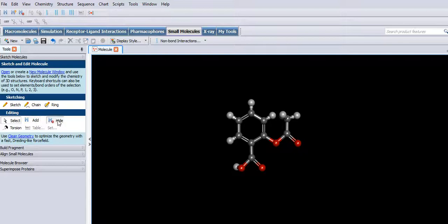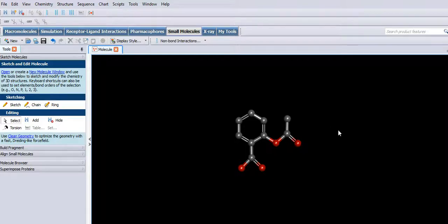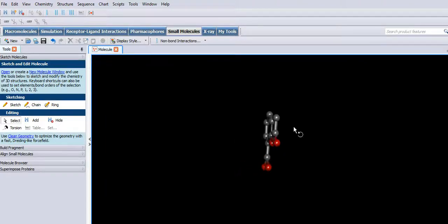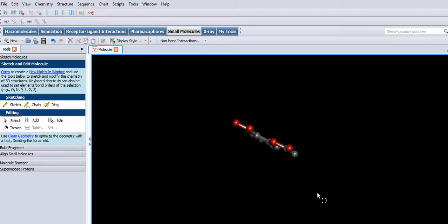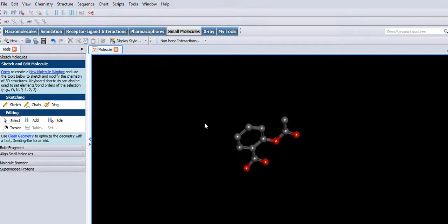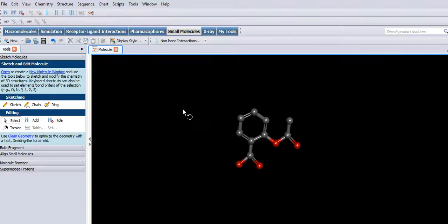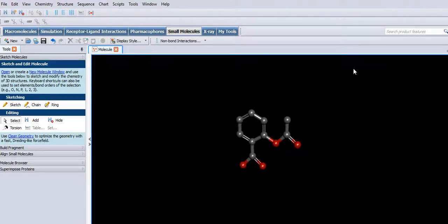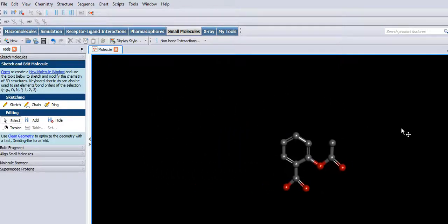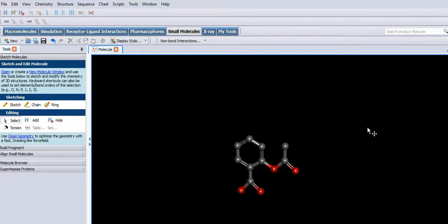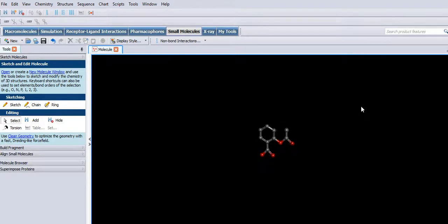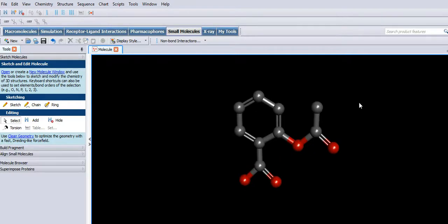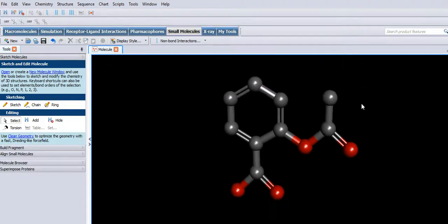Okay, hide the hydrogens. So what can we do with this? Right mouse click will rotate it. And holding down the middle scroll button will move it around en masse until you get dizzy. And using the scroll button will zoom in or out, there we go.